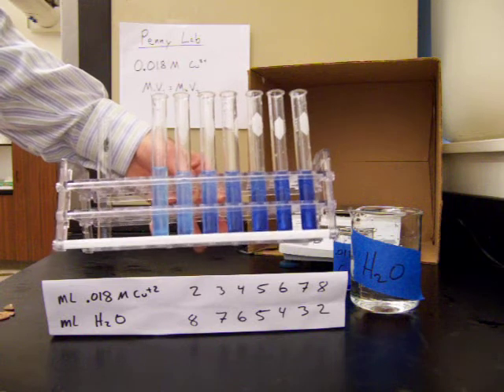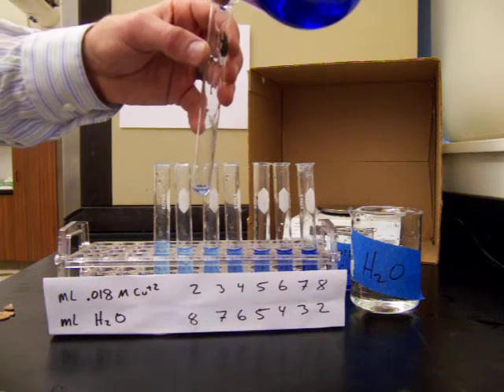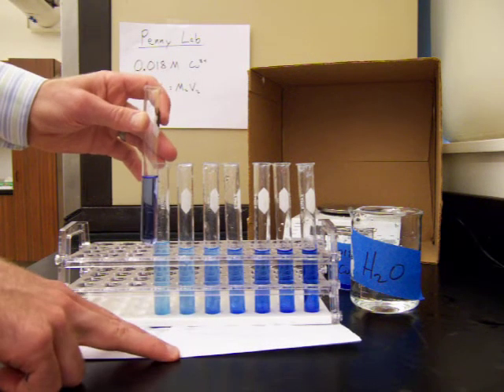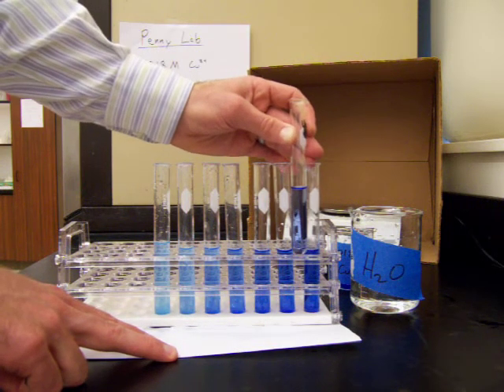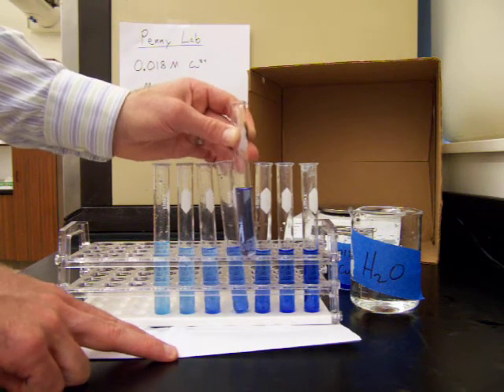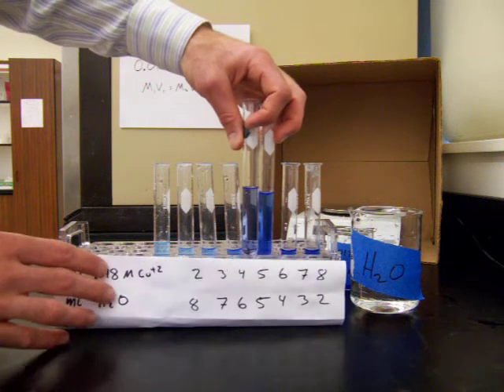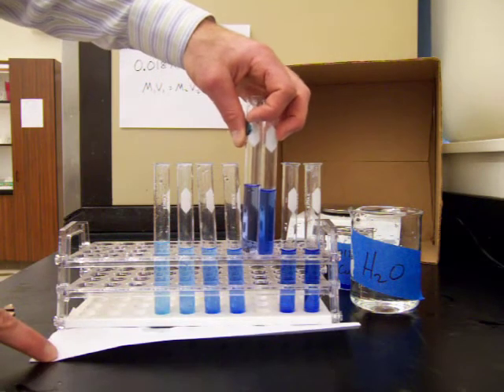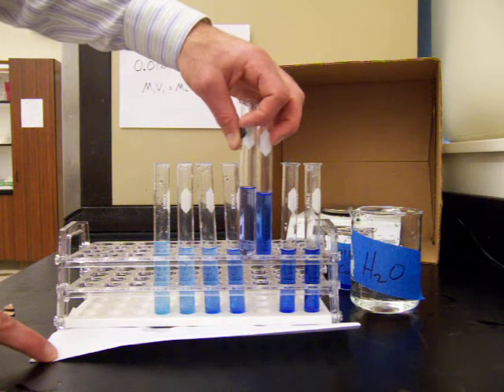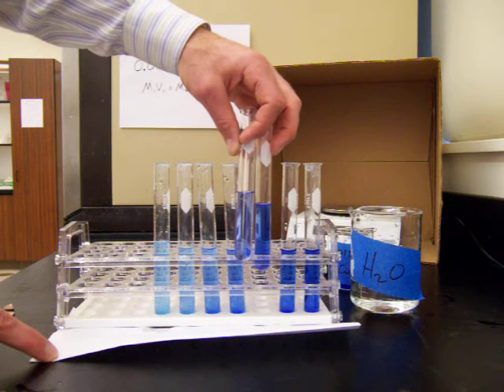We now compare our penny solution to the standardized solutions. I pour a little of the penny solution into a test tube and compare its color to the standards. It's darker than the lowest concentration and not quite as dark as the highest. The closest match appears to be the solution made with 6 milliliters of the standard solution and 4 milliliters of water, giving a total volume of 10 milliliters with the 0.018 molar copper standard.